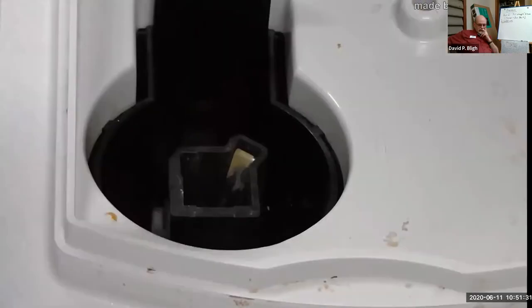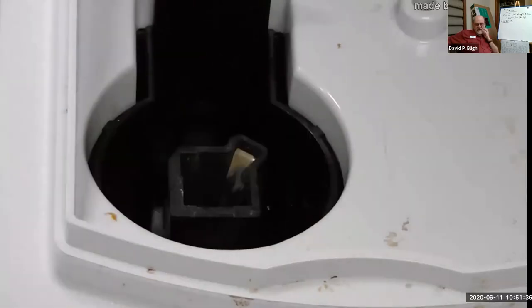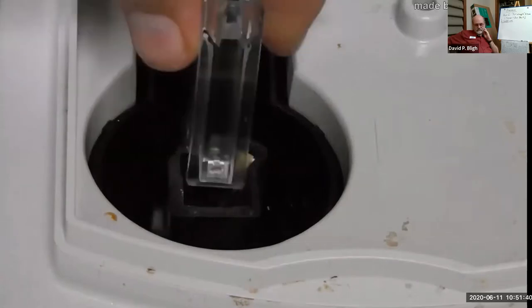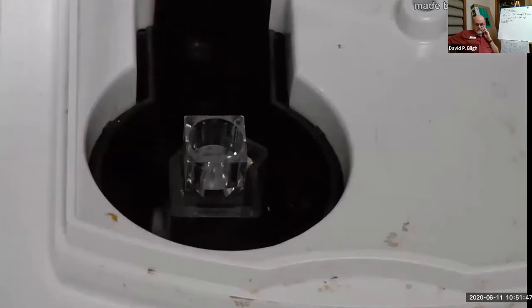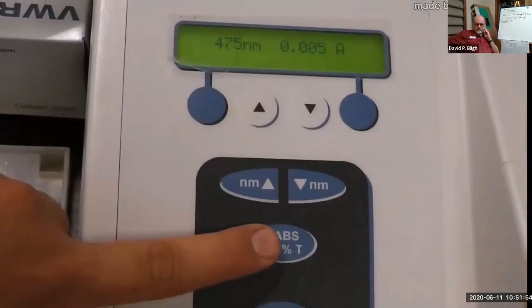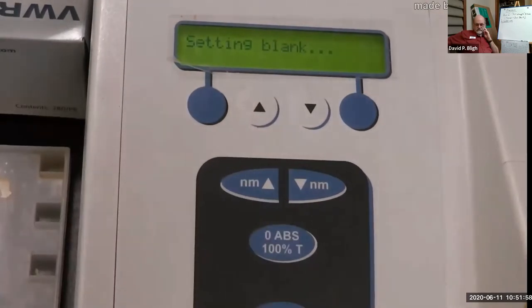If you look closely, you will see an arrow alongside where you put in the cuvette. That is the way that the light passes, therefore your transparent edges must be facing the same way. Put the cuvette in, and again make sure that the light passes through the transparent edges alongside with the arrow. Now you're ready to blank the instrument. Simply hit the 0 abs button as you see there, and it will set the blank. Once the instrument readout is set to 0, you know that you're ready to go.